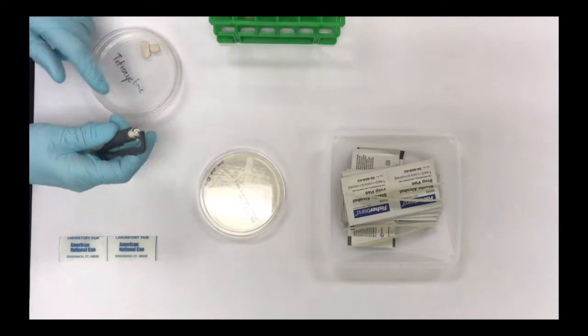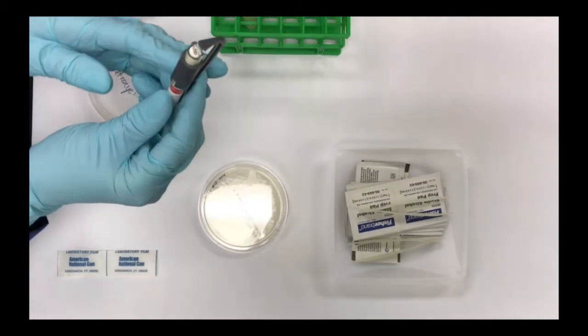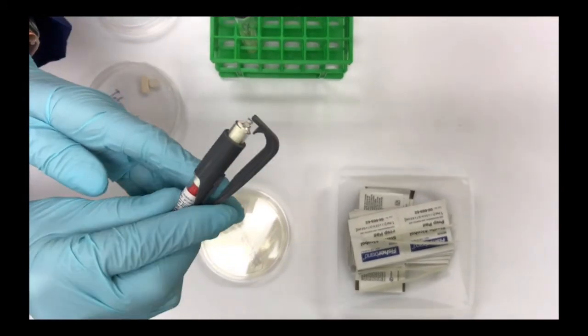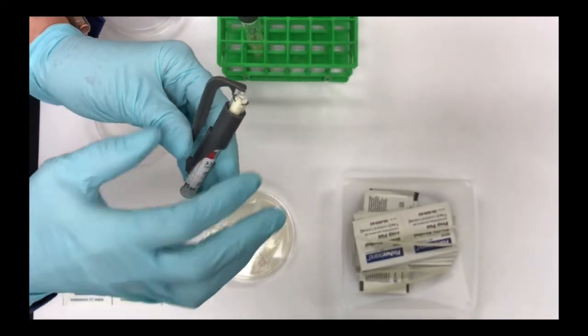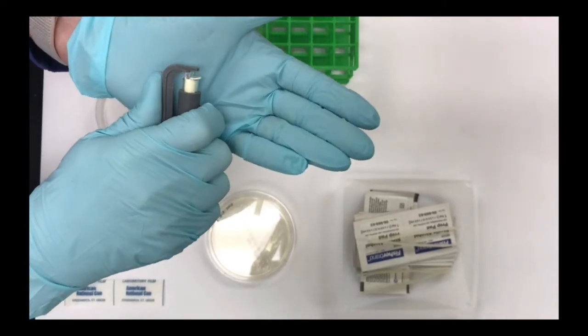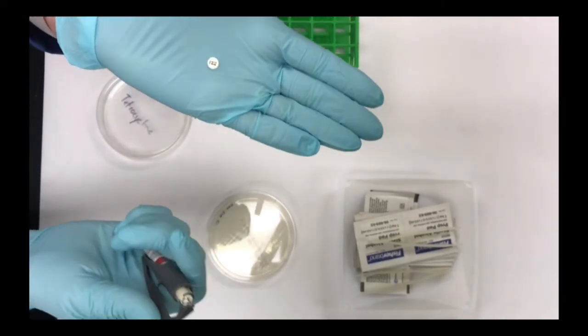Now those discs are arranged in a small sort of column. Those are the white discs there, and it's one on top of another. And when you dispense these, you want to gently push one out, and it should come out like that. Now if you do it too hard, it'll fly across the room like a cannonball. And so you instead want to be really gentle about it and just dispense one, just as seen there.